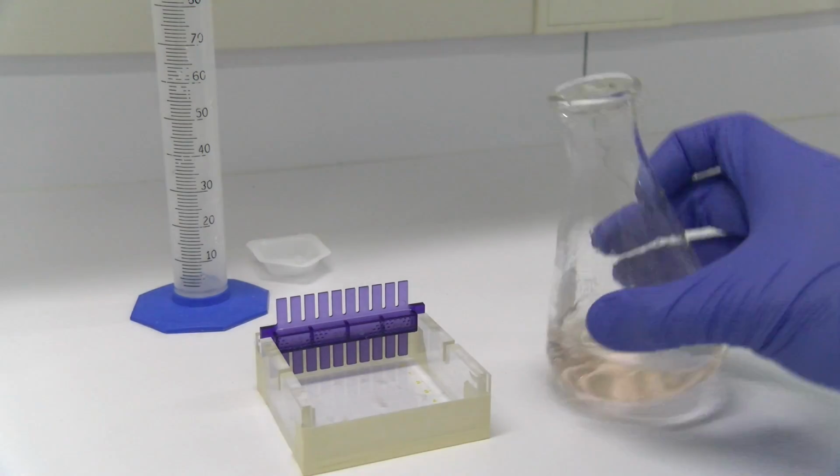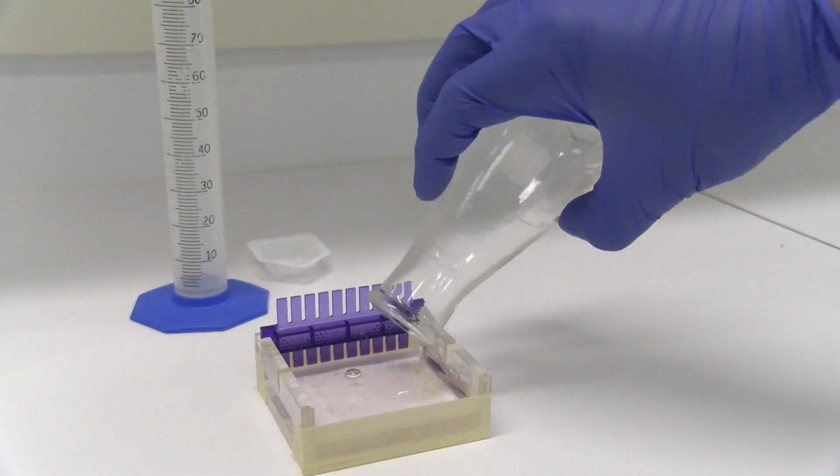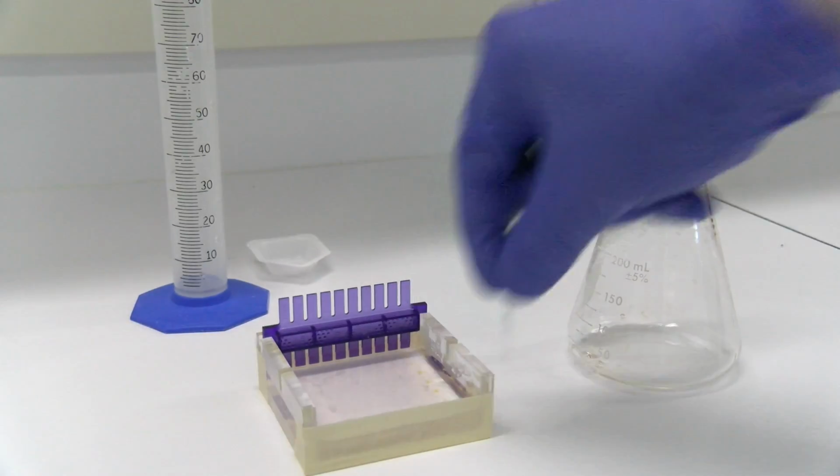Now that we have our solution, we're ready to pour our gel. Make sure that there are not any air bubbles around the comb or in the center of the gel. If there are, you can use a pipette tip to slowly drag them to the bottom left corner and either pop them or consolidate them so that they won't give you any issues in the future.